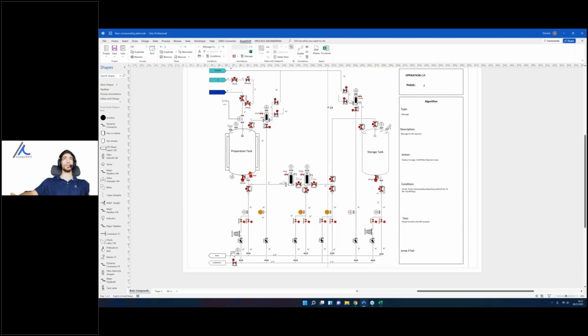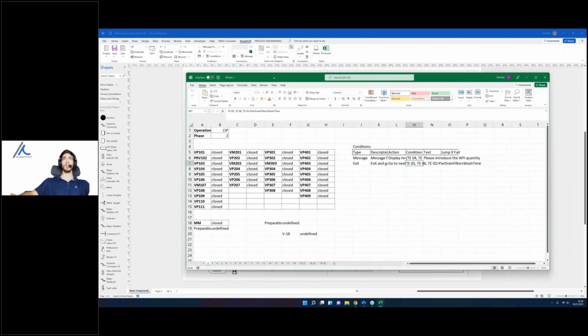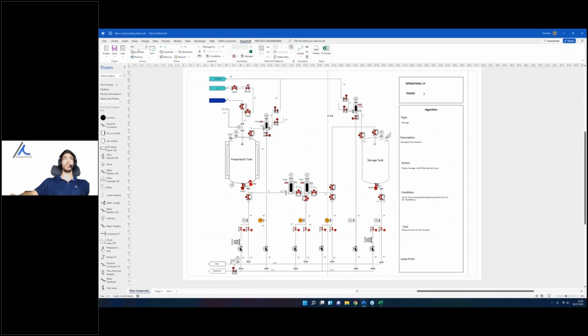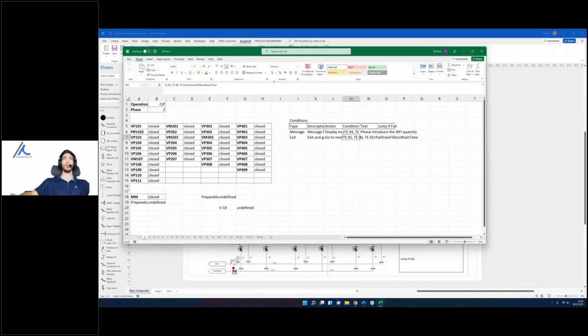Now everything that I've shown to you is available both in live form and in exported form. Everything that is here is in live form. But now let's go to the export. First of all, we note that the Excel files are already a viable export, because you have all the status already created. So you have created the export as you worked. Now, of course, you are able to have more workbooks regarding more processes, CIP and SIP. Now we have worked only on one of them, the CIP process, but you can work with all of them at the same time.